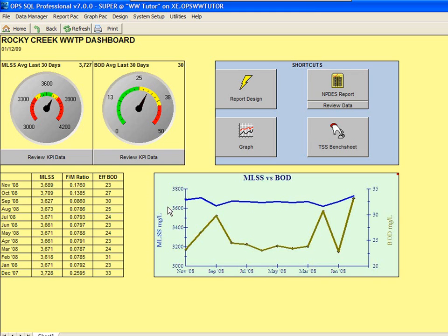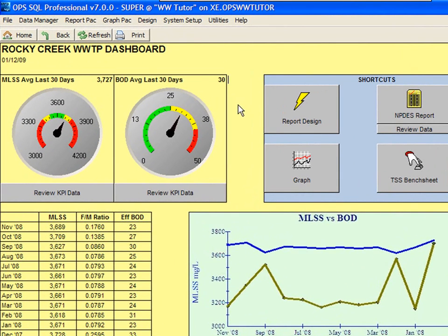And in this case, the customer wants to kind of prove that they do correlate, so we can use this to not wait 5 days for my BOD test to be done, so that I can start to operate the plant based on this UVAS meter. So again, I've already got the data in the system. Ops is a great place to pull all that data together. You set it up. The BOD is already in there because we need it for our regulatory reporting. UVAS is getting into the SCADA system.